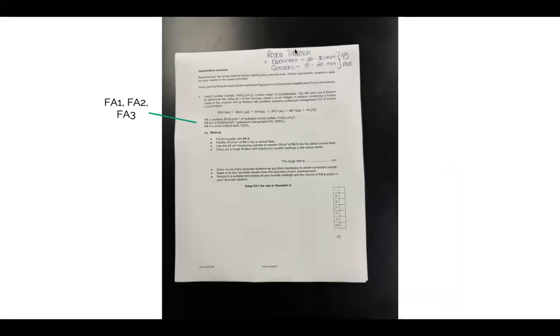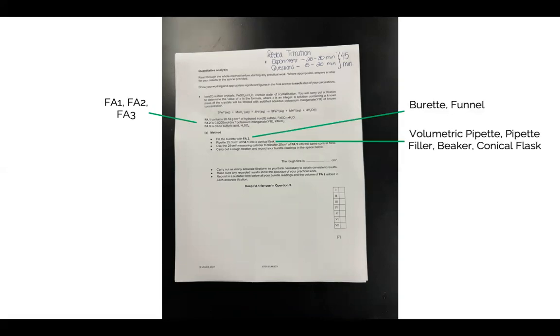So here are some of the materials that we're going to use. We're going to obviously use FA1, FA2, and FA3. To fill the burette, we're going to need a burette and a funnel. To pipette 25 centimeters cubed of FA1 into a conical flask, we're going to need a volumetric pipette, pipette filler, beaker, and conical flask. And then to use the 25 centimeter cubed measuring cylinder to transfer 25 centimeters cubed of FA3 into the conical flask, we're going to need a graduated cylinder, funnel, and plastic pipette.